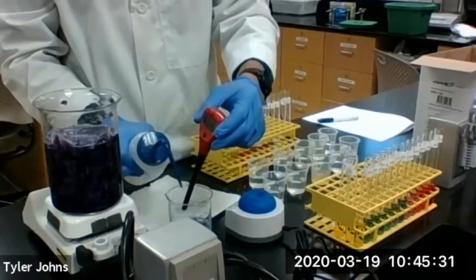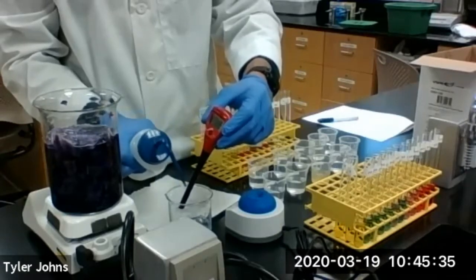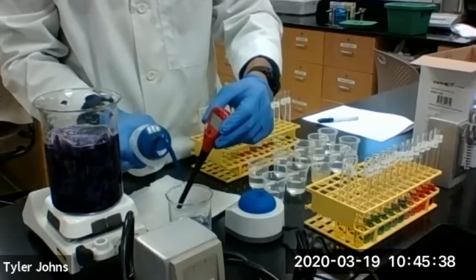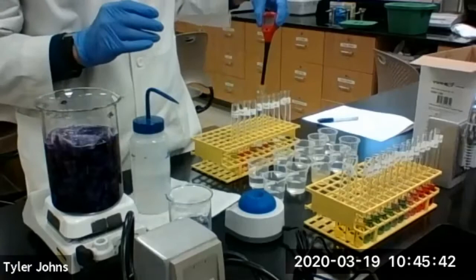We'll rinse our pH probe one more time, and return it to its storage buffer.